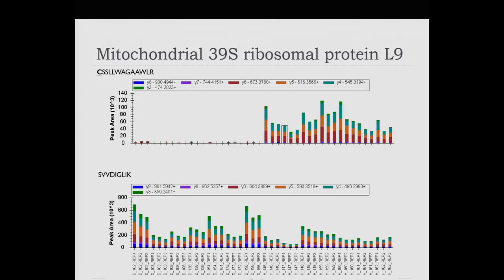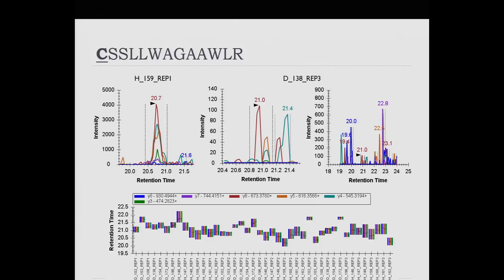a biomarker candidate, but enough to sort of call into question whether we're actually measuring two peptides from the same protein. Although certainly two peptides from the same protein can go different directions based on lots of different possibilities like PTMs and chemical modifications. Okay, so it's very easy to do this in Skyline.